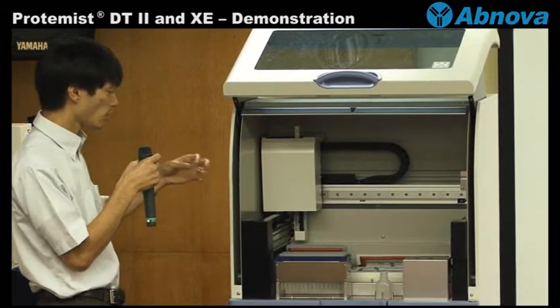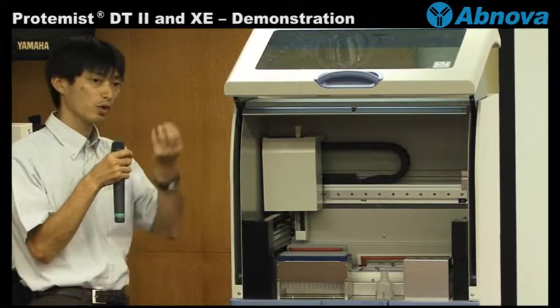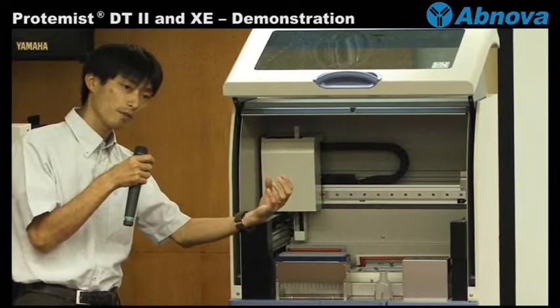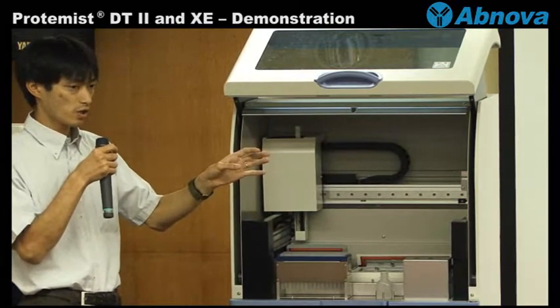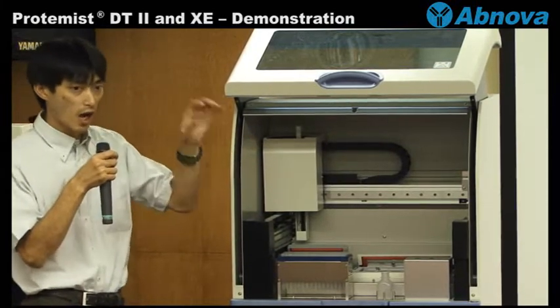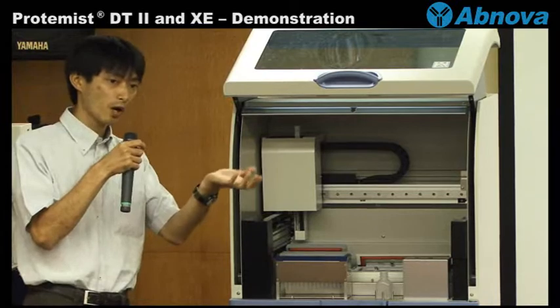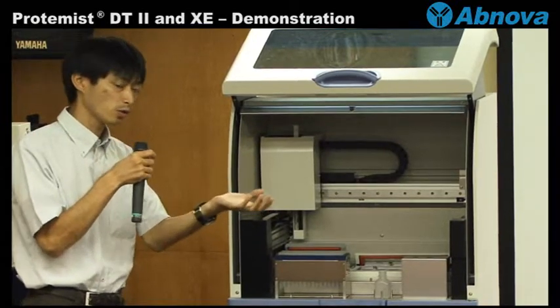Then robot transfers reagent extract to messenger RNA to mix them. And then the mixture of messenger RNA and reagent extract is going to be added under the translation buffer, bottom of the cartridge, to make a bilayer.